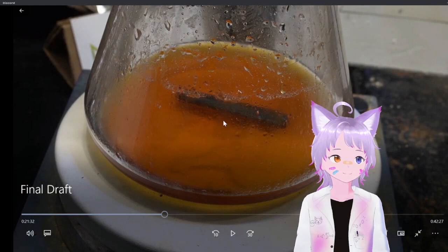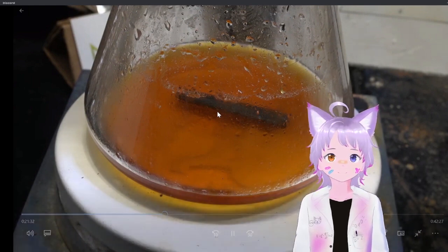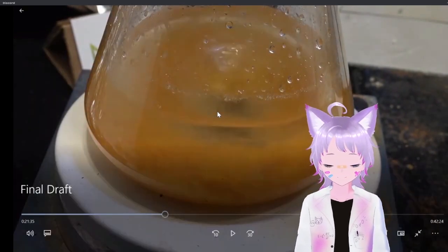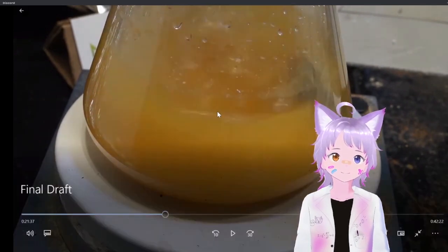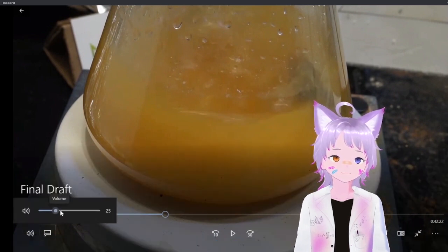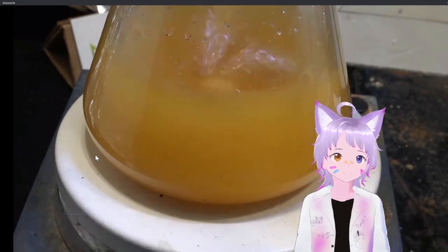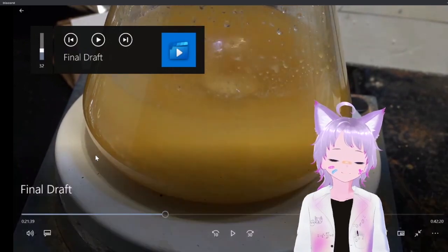Yeah, I know. But I'm saying maybe if we use ethanol, maybe at 80 Celsius it might mess things up. We don't know. We'll have to try it. Anyway, let's continue. But I honestly think ethanol is better, for being real. Let's play it. What did he do there? What did he add? So he just added water. Let's continue. Yeah, it's good. Let's go.